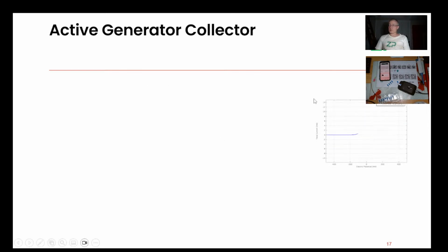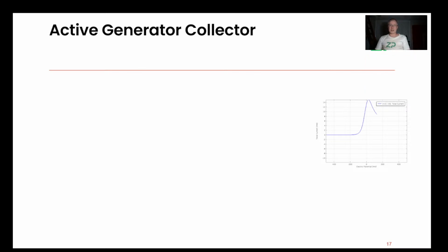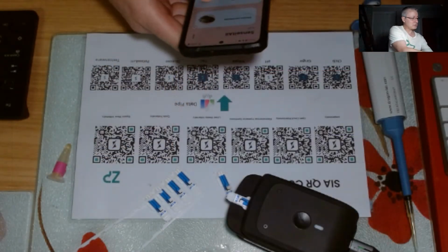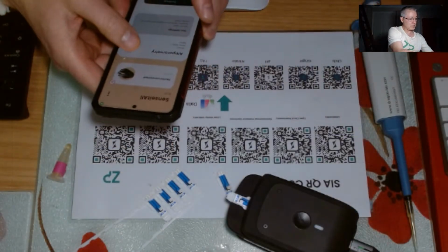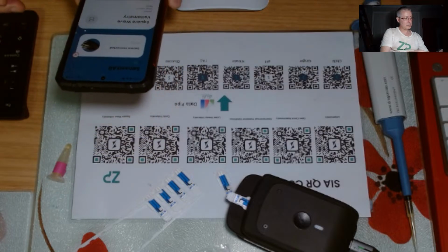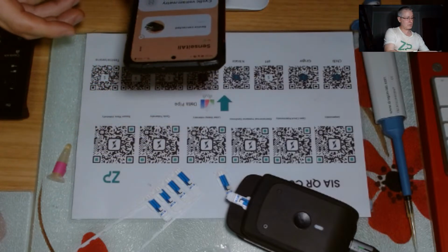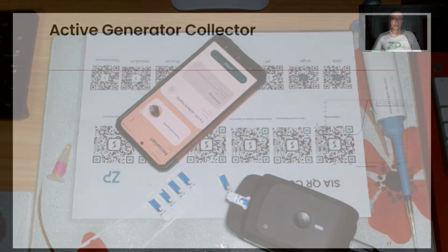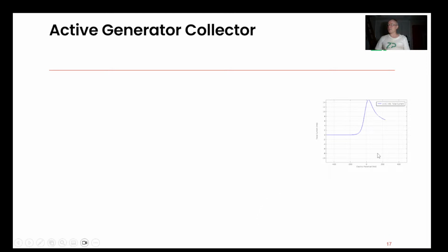I'm going to do a bit of background on this. I'll be a bit pedantic, but that said, I'm going to use the idea of the oxidation of ferrocyanide to ferricyanide to help me think this through. So if I do a cyclic voltammetry on ferrocyanide, and quick plug, this device will definitely do cyclic voltammetry. So first of all, I'm just thinking about cyclic voltammetry to start with.